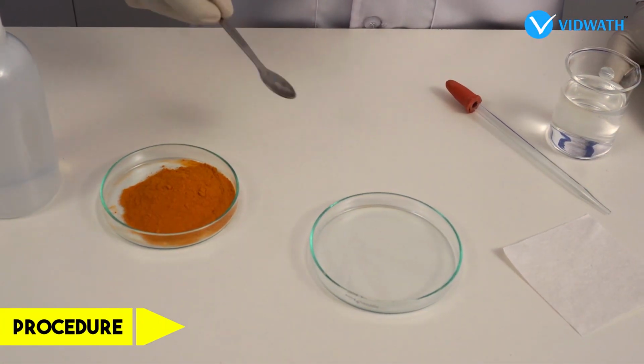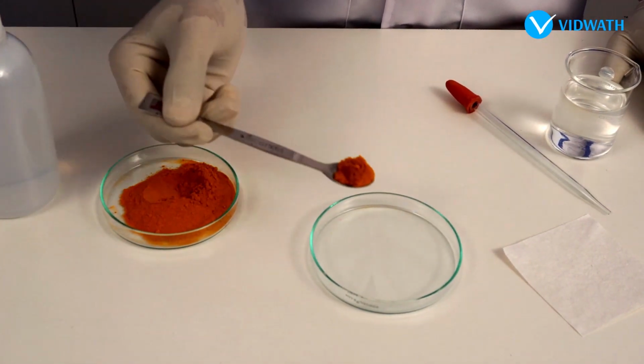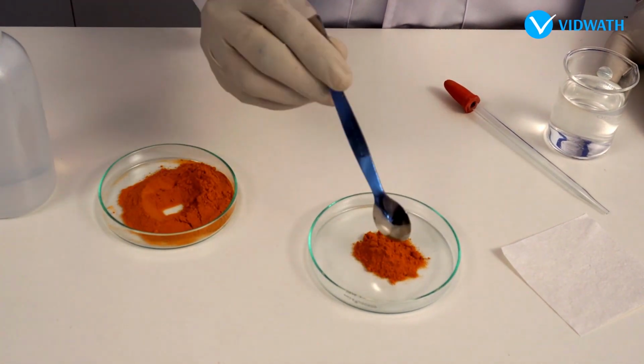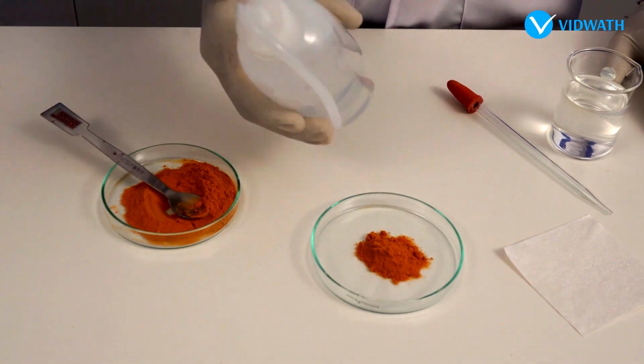Procedure: take 2 spatula full of turmeric powder in a Petri plate. Add a little water and make a paste.